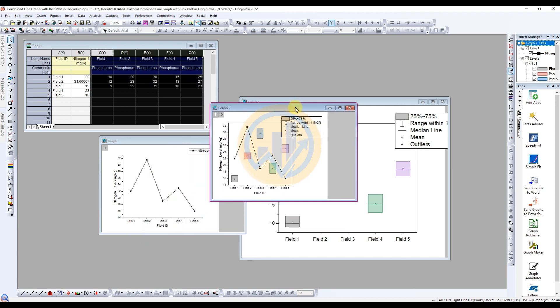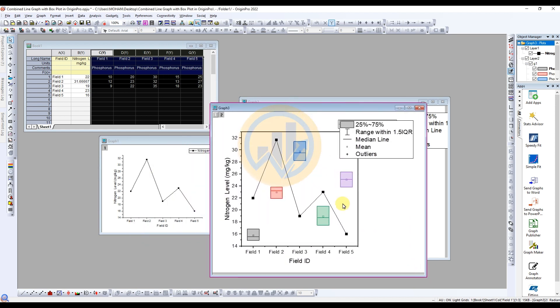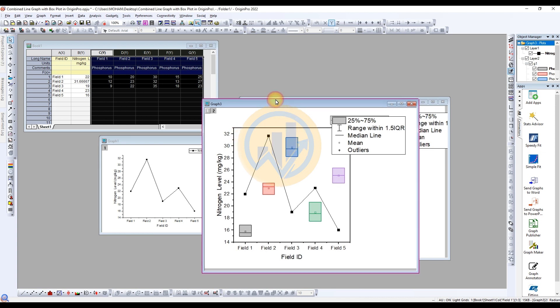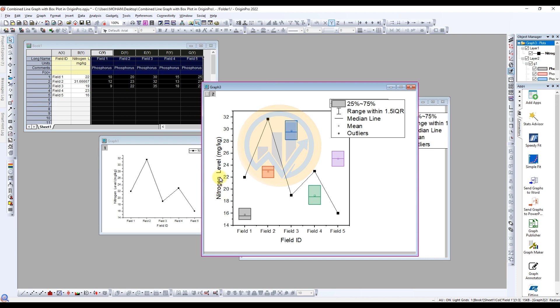Click Show Axis Frame to merge the axis values. Then click OK. Now the graphs are merged. This is the combined line graph with the box plot in OriginPro software. Next, change the text for the Y-axis name. Select the text, hold and select it, and change the name to Nitrogen and Phosphorus.